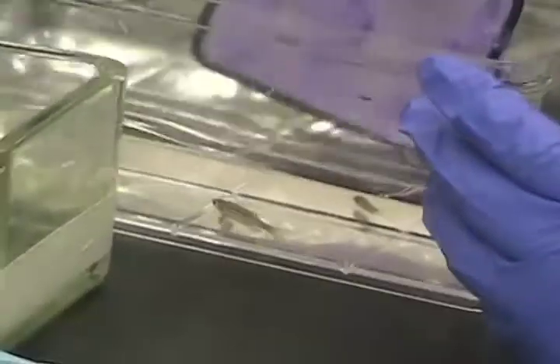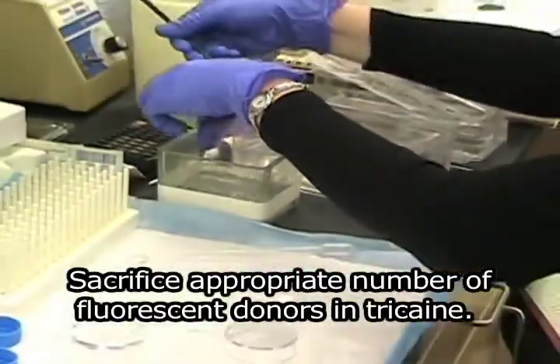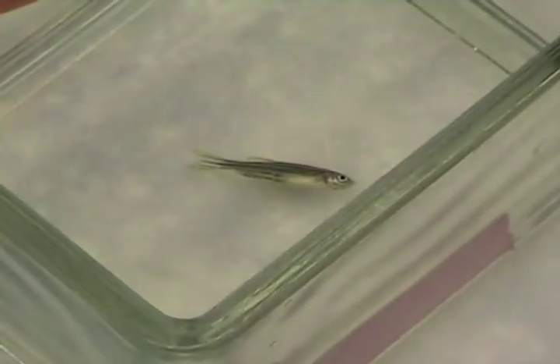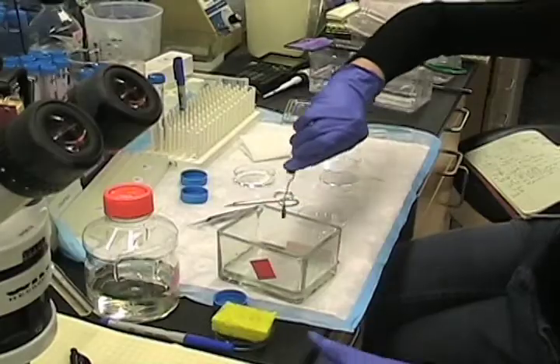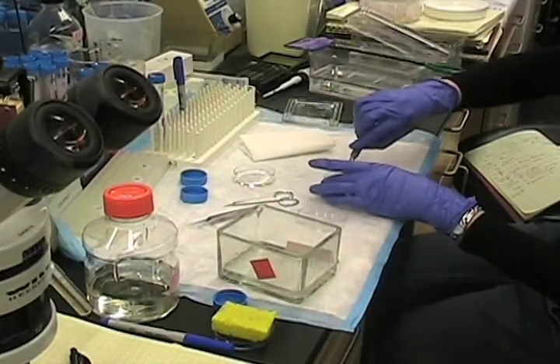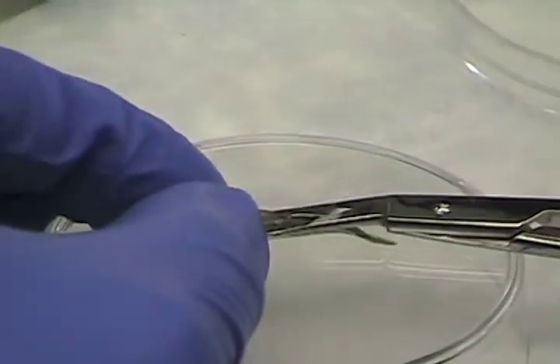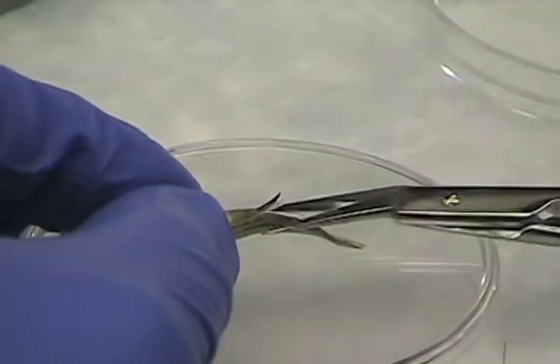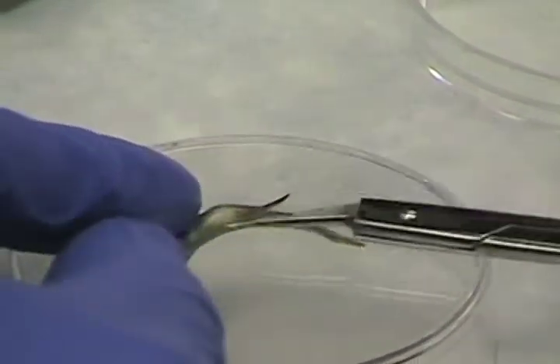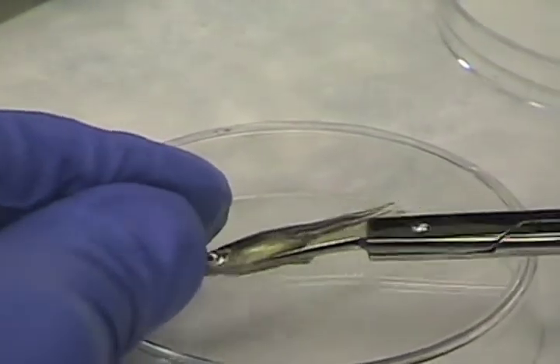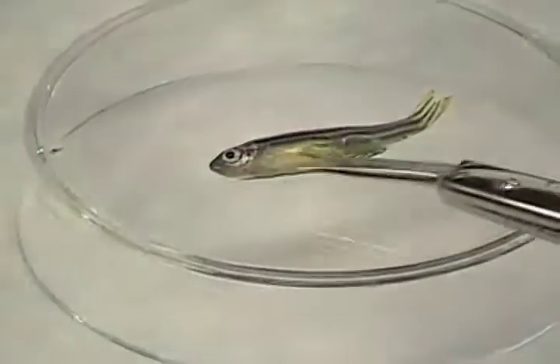On day of transplant, sacrifice the appropriate number of fluorescent donors in tricaine. Just wait until you can't see the gills moving anymore. I just put some on a dish like this, just a platform, and then make a small cut right below its belly, and then I can insert the scissors and cut down the belly like this. So now it's cut all the way down here.